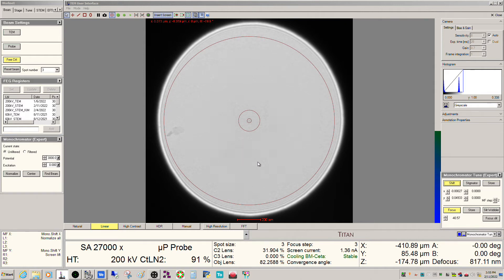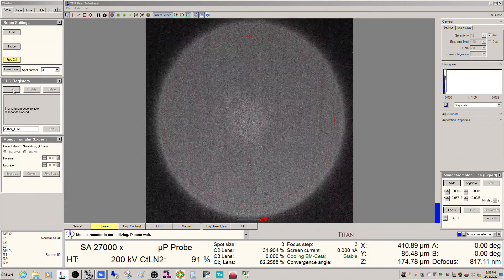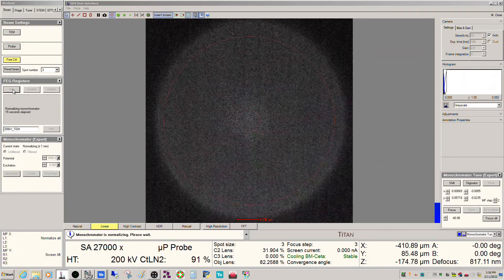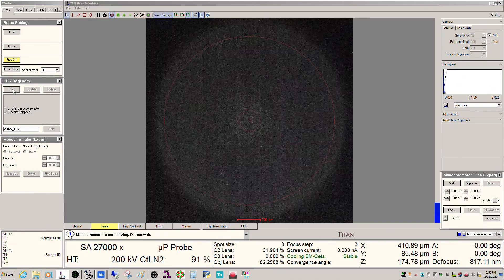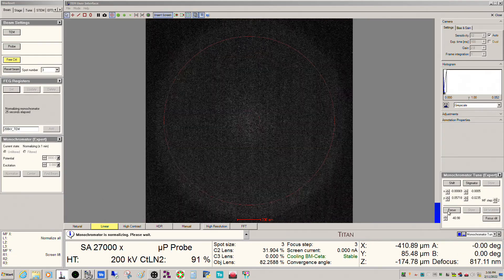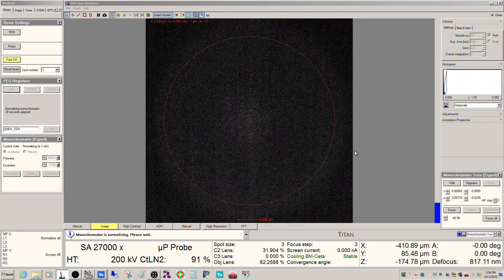There is also an automated way to do this in addition to doing it manually. If we look here, I'm going to set the TEM FEG register. It's going to recall a shift and a monochromator focus and also do a normalization. What we're probably going to find is that the monochromator is not going to be centered anymore — the gun lens should be at the value we want, about negative 40, but it's not going to be centered. So we can tell it to center using an automated method.